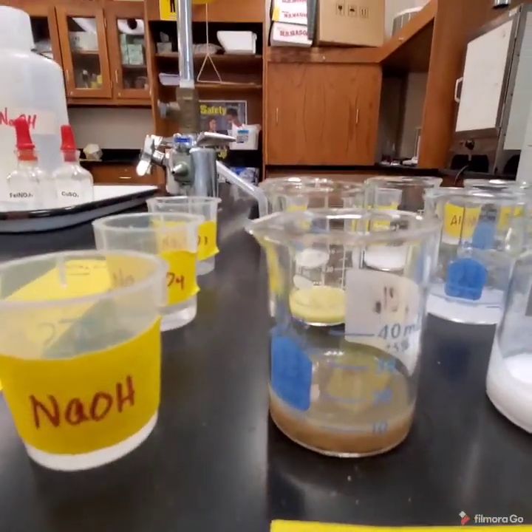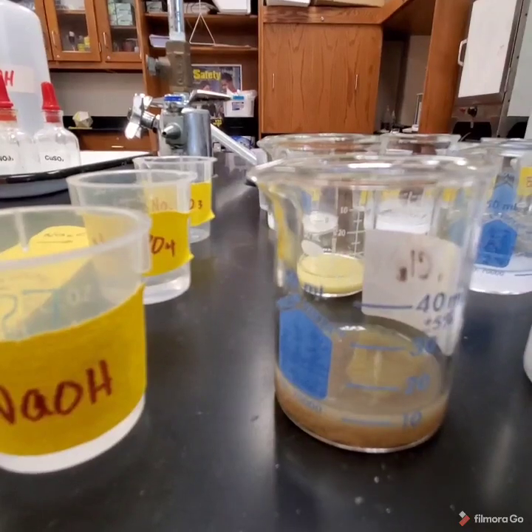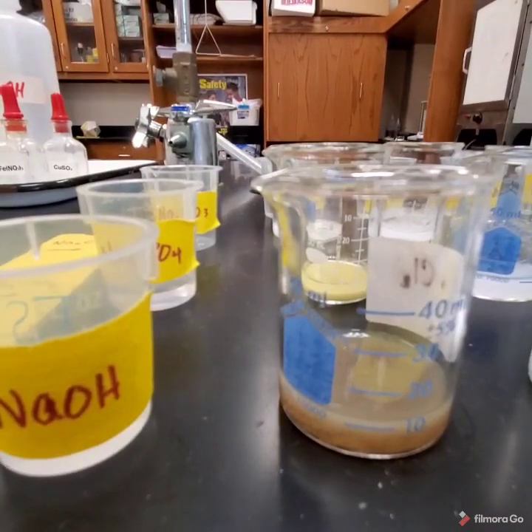This is the first column that we did with the silver nitrate and the sodium hydroxide, and we have that brown at the bottom and that liquid layer at the top.